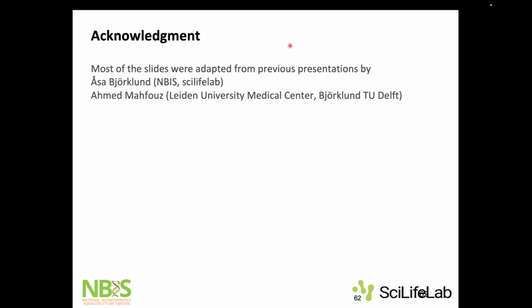Hi, Fariba. Thank you so much. I have a question regarding the unlabeling rate. Many times in cancer cells, you have these epithelial to mesenchymal transition states, and you have many cells in these transition states. Is it possible, when you take a reference data set that has marked these transition state markers, what is the chance that those transition states are compatible with your data set, or how much can I afford to lose on this information?